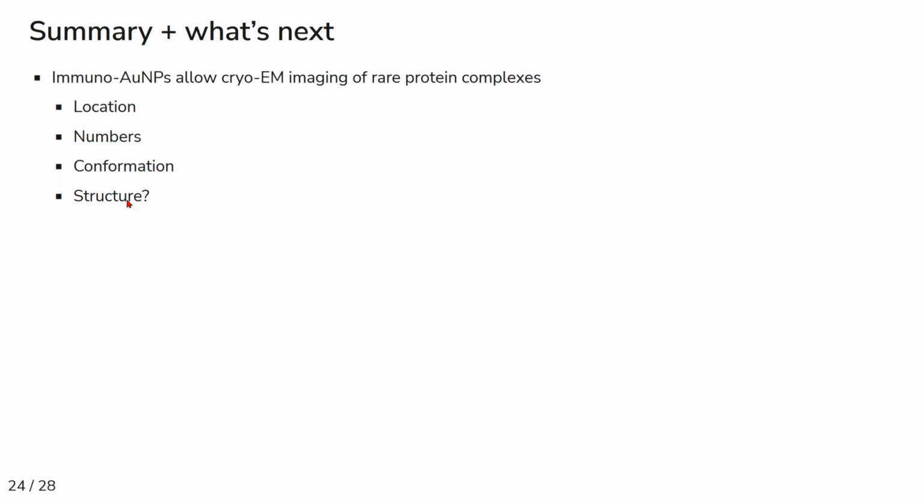actual structures. We weren't successful doing that with this existing data set because even though we collected a lot of tomograms, in the end we were still only left with a few hundred copies of protocadherin 15, and for good subtomogram averaging you ideally have thousands or tens of thousands of copies. And furthermore, protocadherin 15 turns out to be highly flexible, so any attempt to average them always resulted in very fuzzy results because they don't overlay exactly.